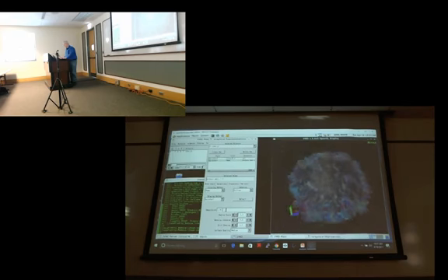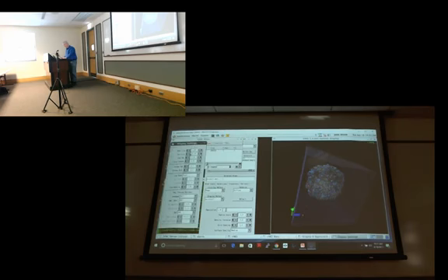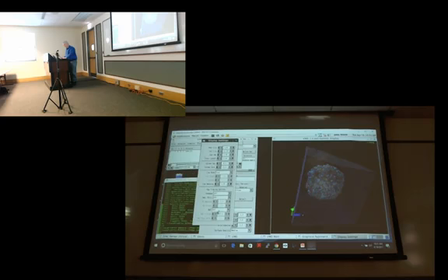So I have depth queuing turned on. So even with OpenGL, if I rotate it around, you can see where there are cavities and pockets. And I'll show you now, this is one of these examples. I'm using a Linux machine. I'm going to get ready to do a run of the ray tracer. I'm going to turn on shadows and ambient occlusion lighting. You see nothing happens in OpenGL when I do that. These don't affect OpenGL at all yet.